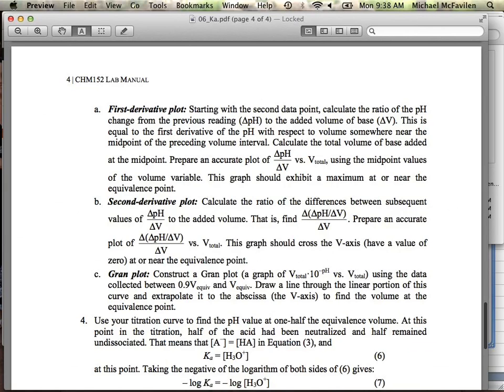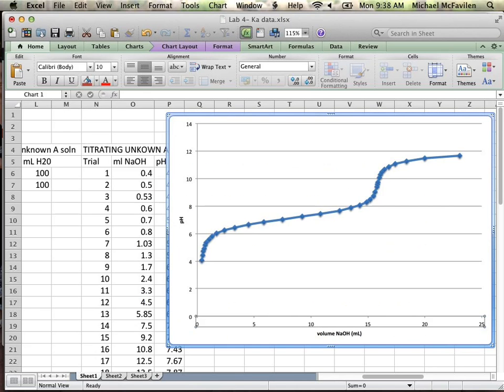The lab report, do you have to show those different graphs? The lab report will have at least 3 graphs. The zoom-ins? No, just show the overall. So what I would expect for your first graph is just your pH titration, no zoom in. You would write in the caption for your figure what your equivalence value was and what your half equivalence was. So you're going to give me that interpretive information off of that curve, but you do not have to zoom in on it to get that all figured out.